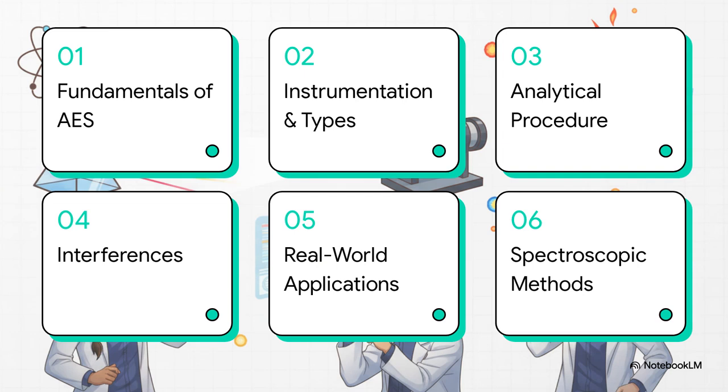Okay, so here's our game plan for today's explainer. We're going to hit the fundamentals of AES, check out the instrumentation and types, walk through the actual analytical procedure, navigate the inevitable interferences and limitations, look at some awesome real-world applications, and finally, compare it to other spectroscopic methods. Let's get right into it.